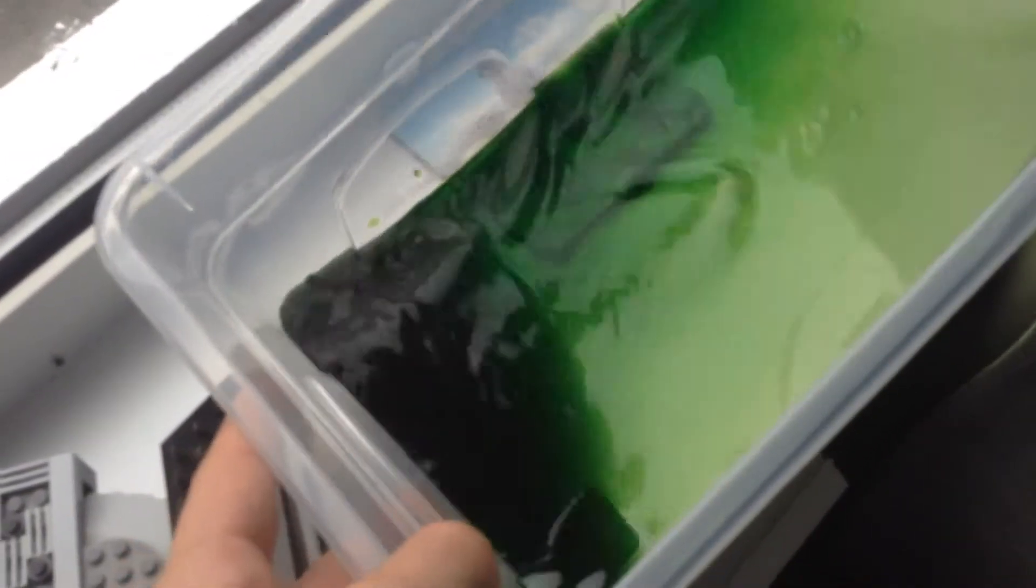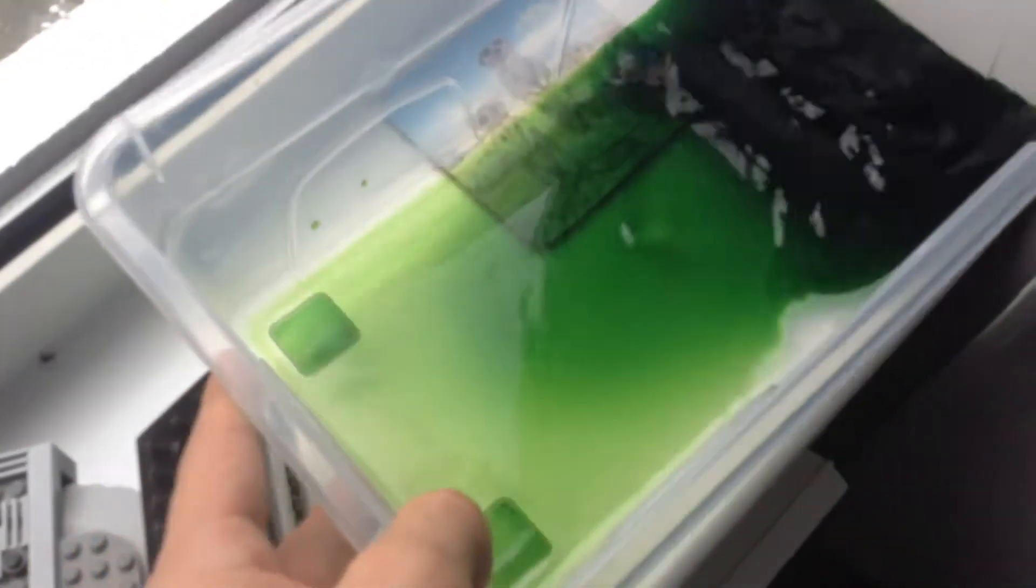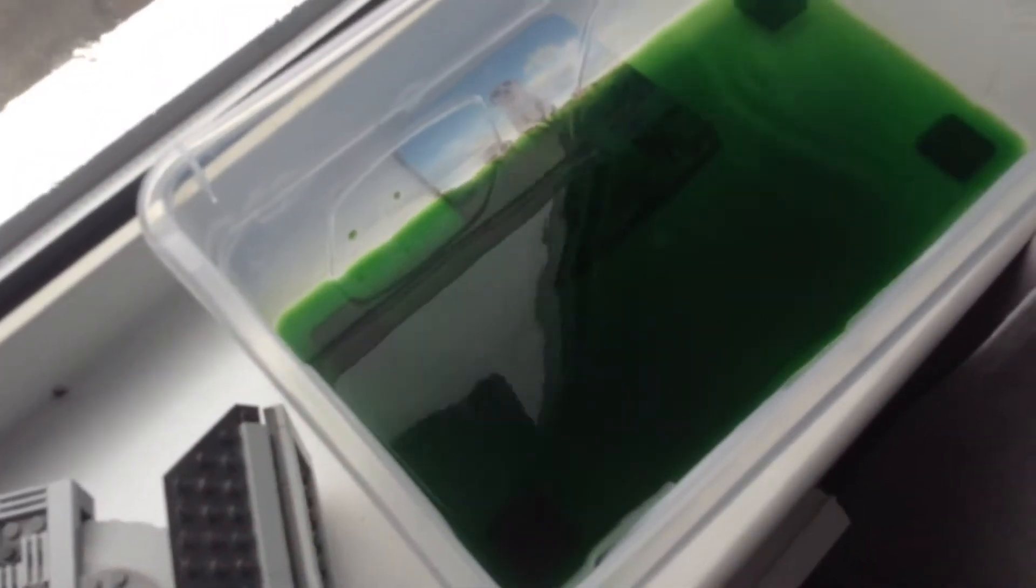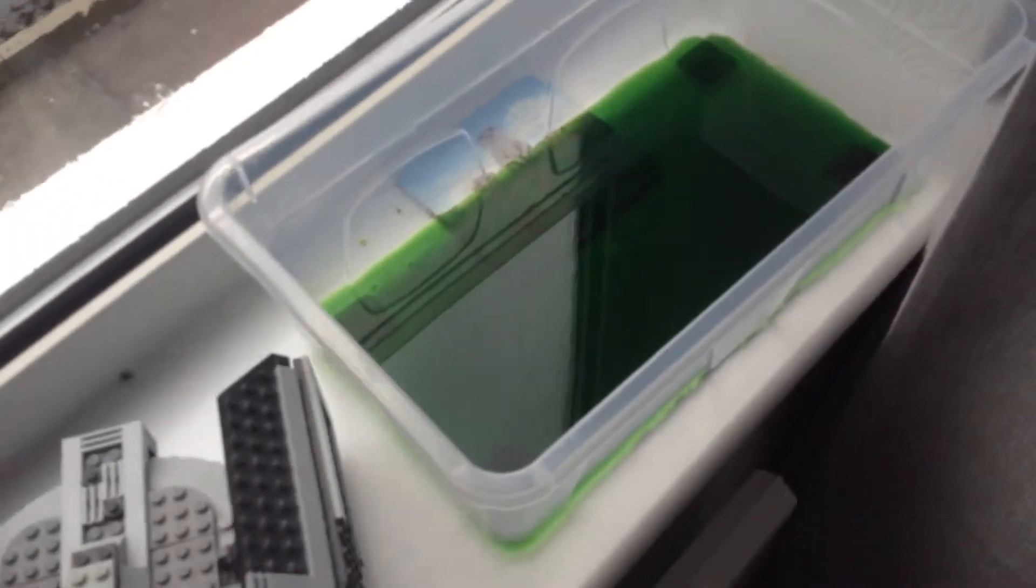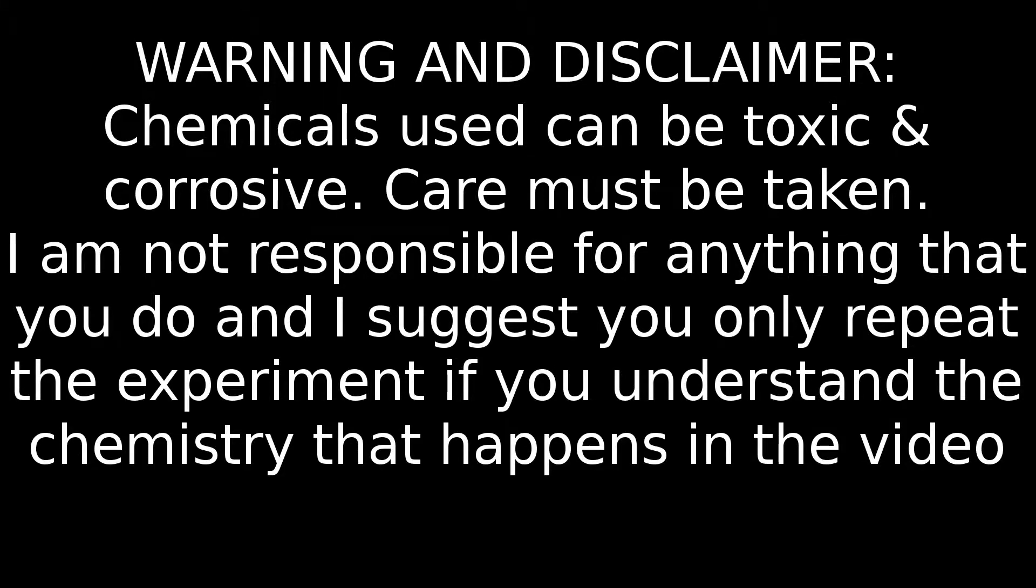Today I'm going to be starting my project of extracting the nickel and chromium from nichrome wire. In this video I'll be synthesizing the nickel 2 chloride and chromium 3 chloride which I will use to extract the metals in another video.